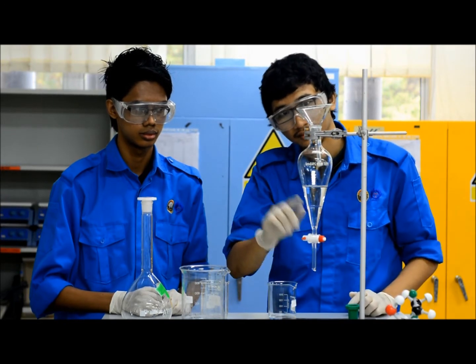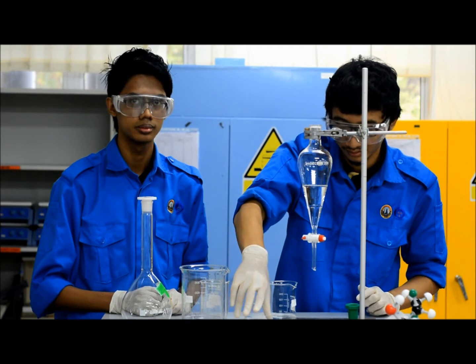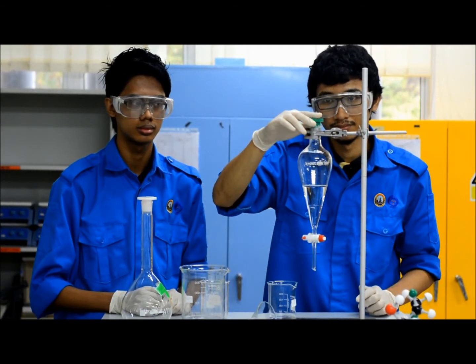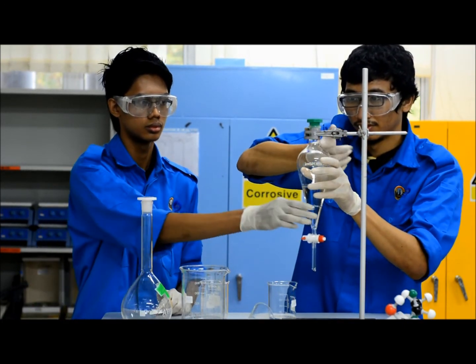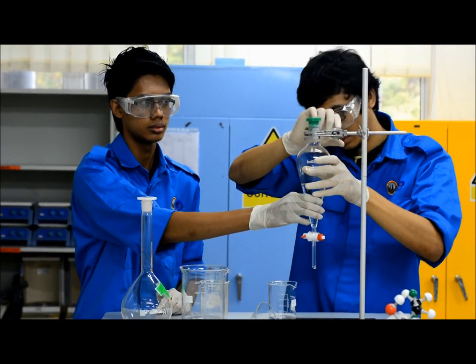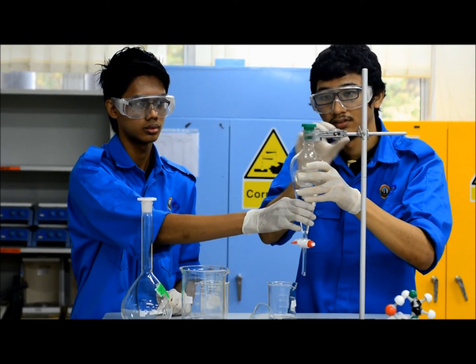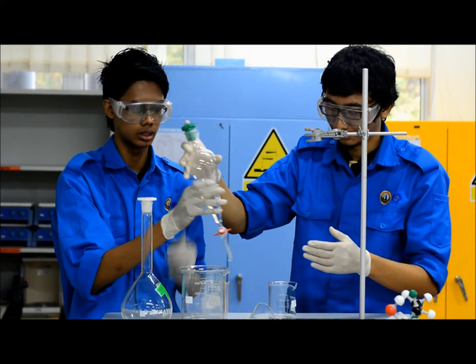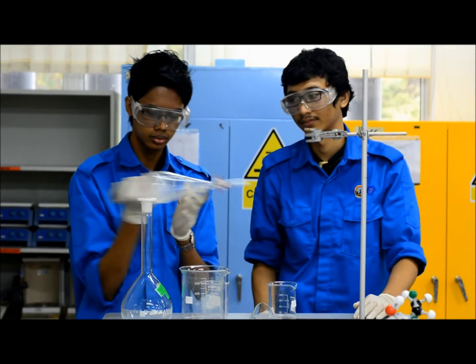From that, we can see that there are 2 layers of liquid. After that, insert the stopper and pick up the separatory funnel. The separatory funnel was shaken gently.